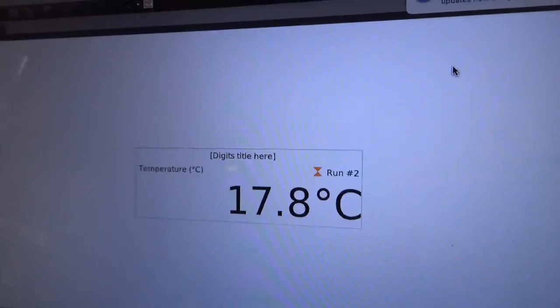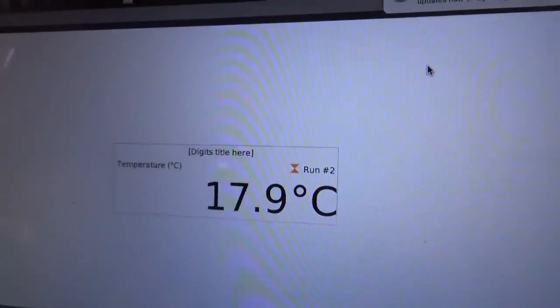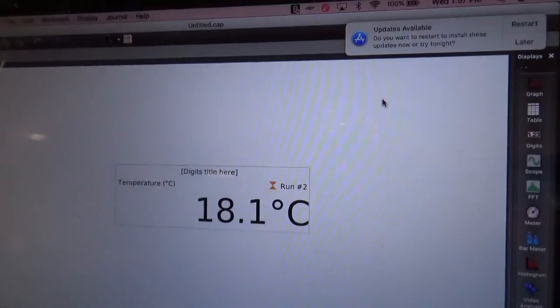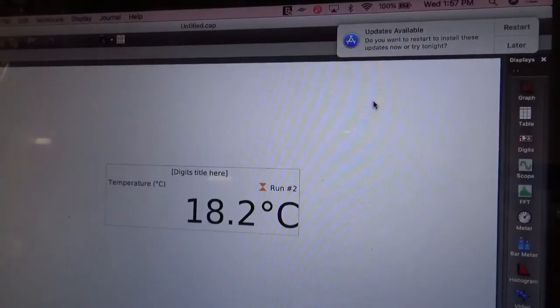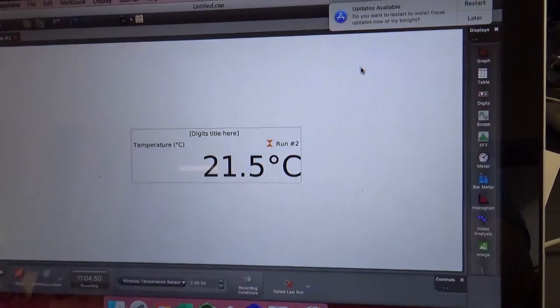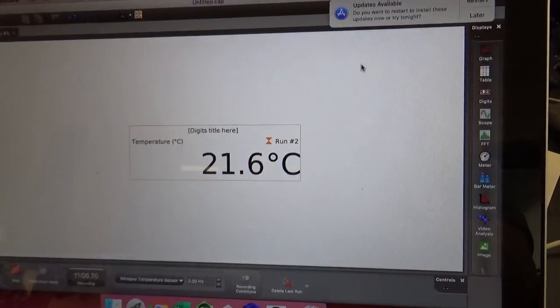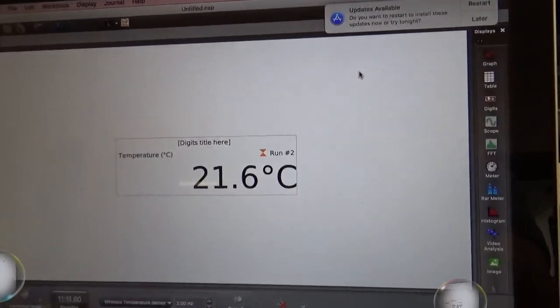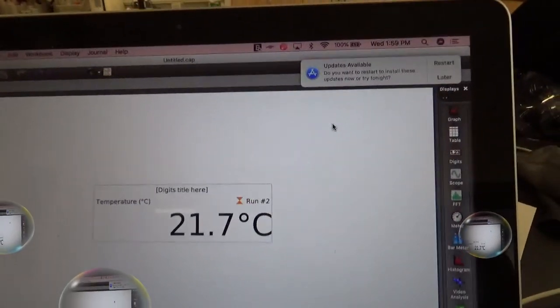No, folks, we didn't have anything special for breakfast. And if it does get a little higher than 25, no problem, because I'm not at the saturation point yet. That bug is not dissolved yet. All right, I think I'm gonna add them. I can't wait. I'm worse than they are. Let's do some calculations or something, you know.